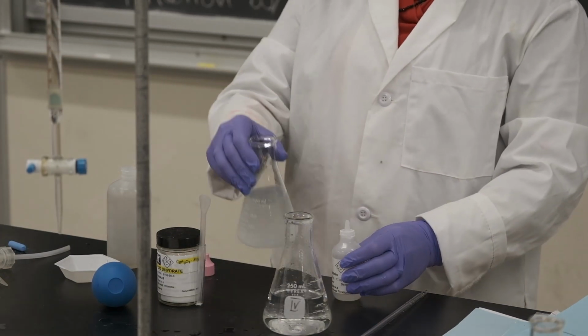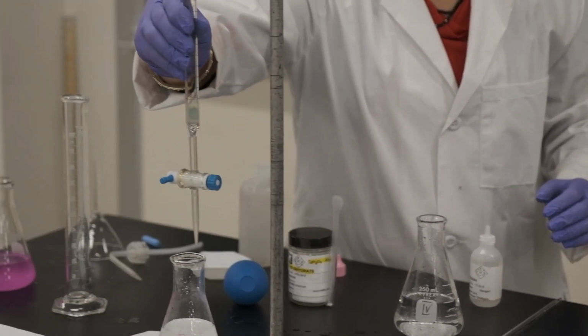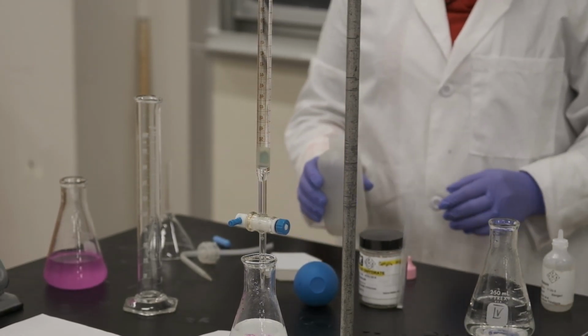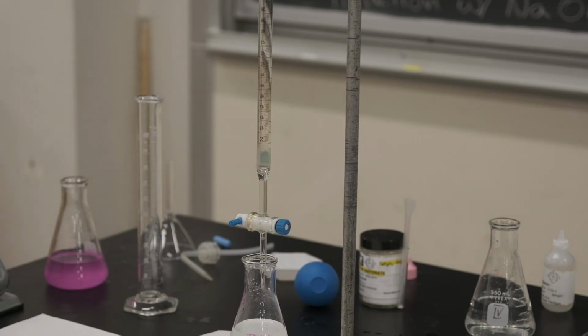So here's my indicator. Let's fake that this is my sodium hydroxide solution. Every time I'm titrating, what I want to do, does anyone have another wash bottle filled with?